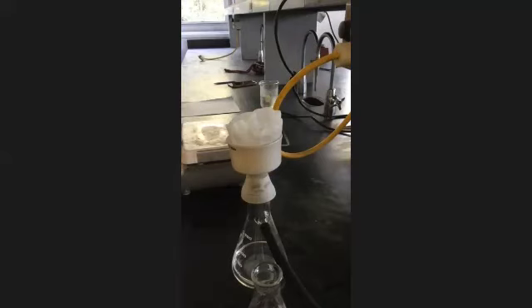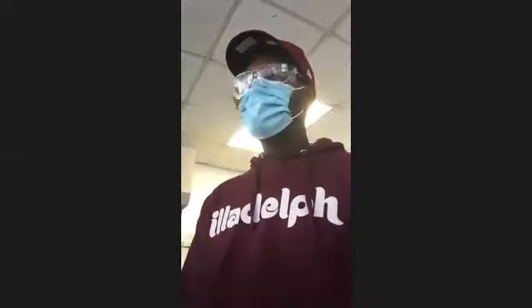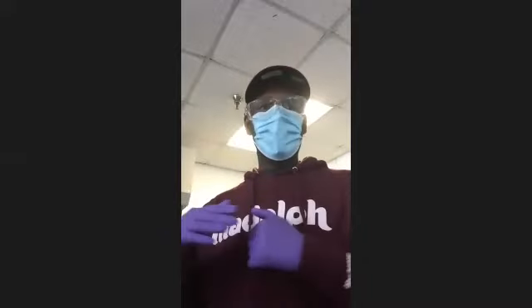Okay. So for those of you who are on Zoom, the purpose of having the density of your acetic anhydride is because it's the liquid. So you want to be able to go from milliliters to grams, which you do using the density, and then from grams to moles. It's very important to calculate those moles because if you don't, when it's time to figure out what your limiting reagent is and get your theoretical yield, you're not going to be able to do it.